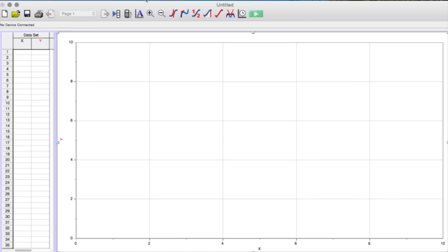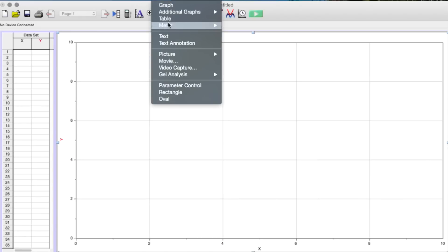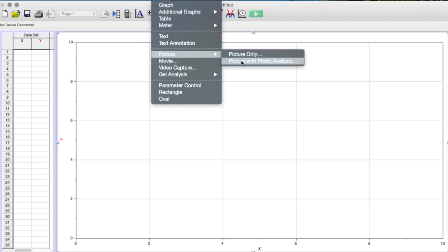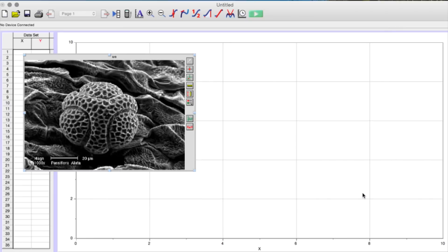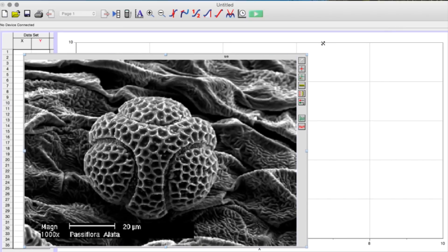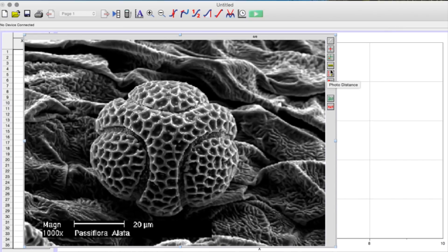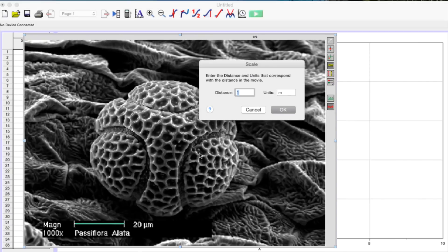To use Logger Pro, you will need a digital image with a scale bar. Choose the Insert Picture with Photo Analysis tool and find the image on your computer. The yellow ruler icon on the right-hand side is the Set Scale function. Click on it and then drag the mouse along the top of the scale bar. Logger Pro will prompt you for the actual size of that distance, at which point you would refer to the value printed next to the scale bar — in this case, 20 micrometers.